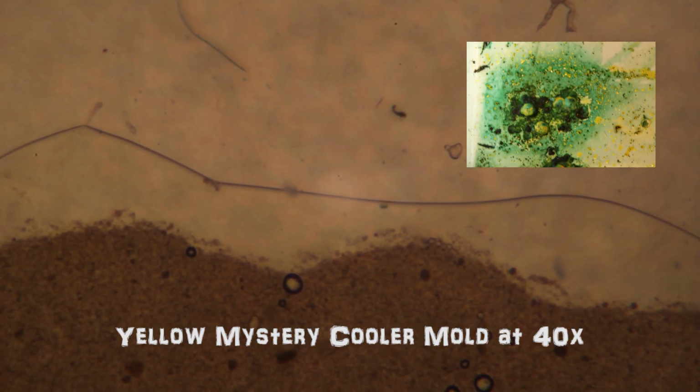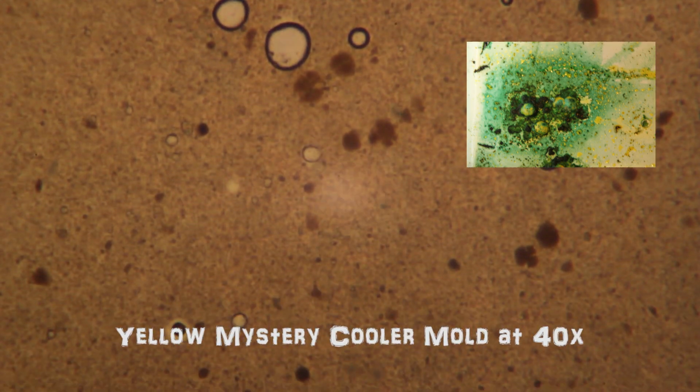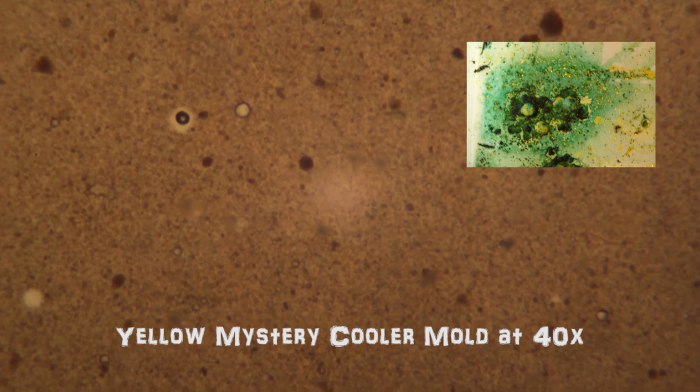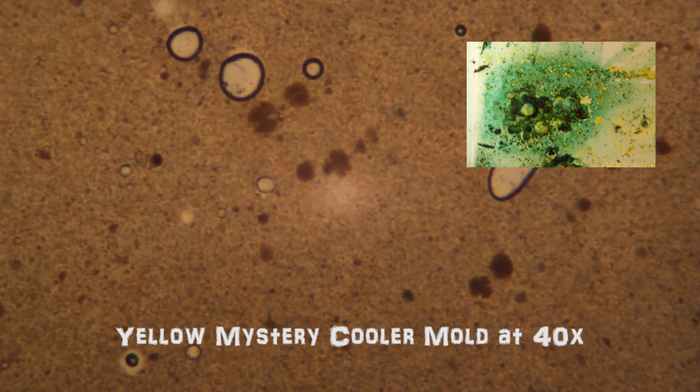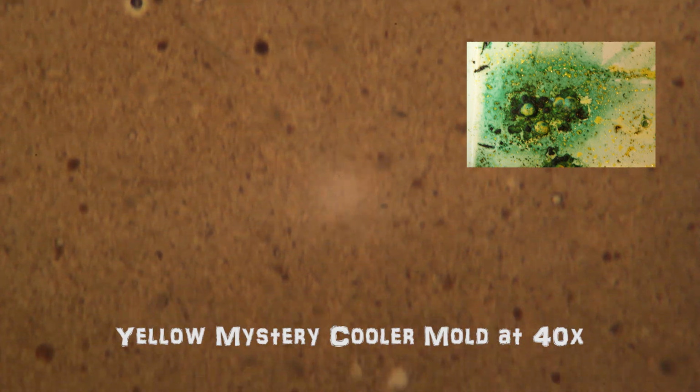So the very first thing I'd like to do here is actually put a picture of the mold in the upper right-hand portion, just so we can get a better look at it. And what you'll notice in that picture is that there's actually a yellow portion of the mold, which is more of a liquid, and then there's a green portion, which is more thick and fibrous. What we're looking at here is the yellow mold at 40 times magnification.